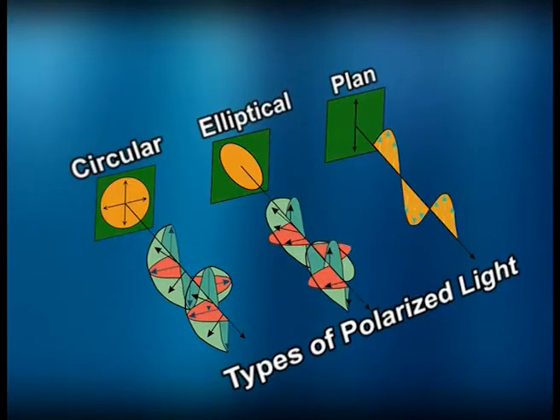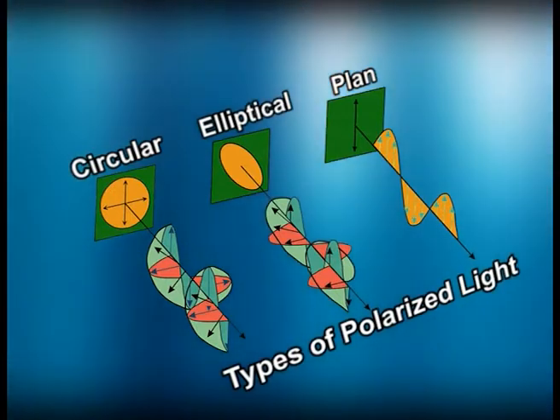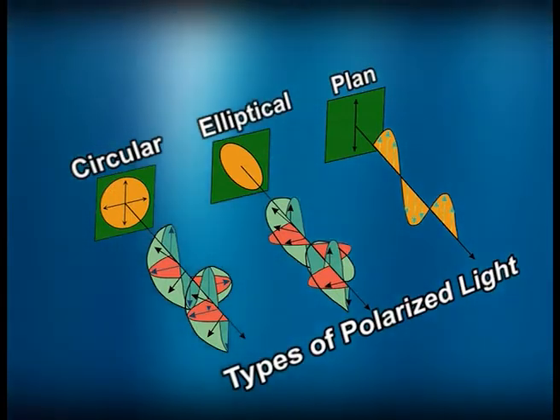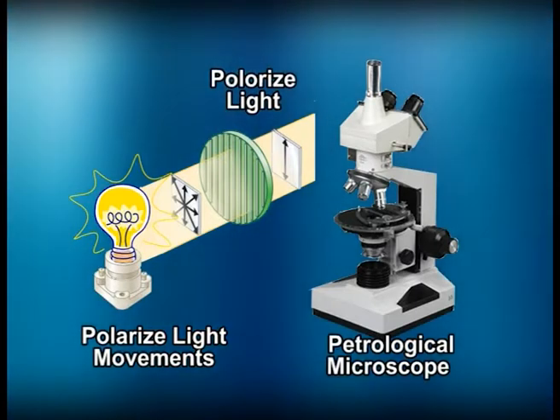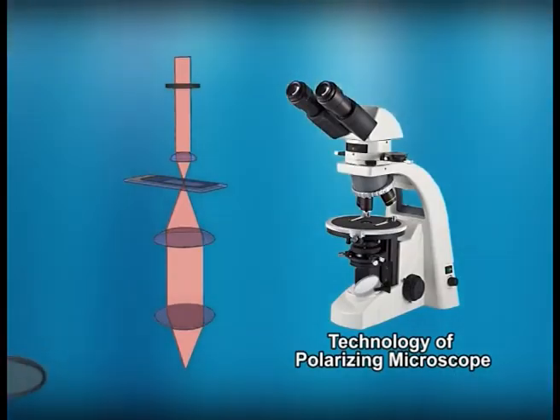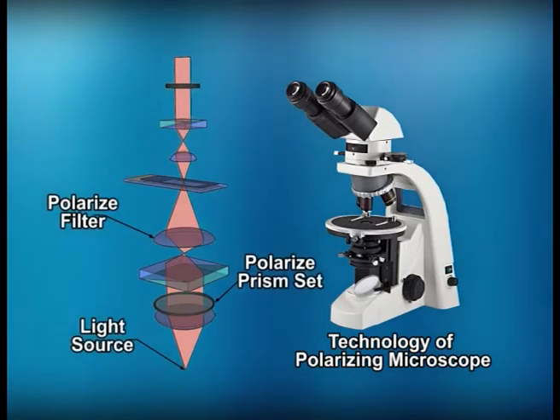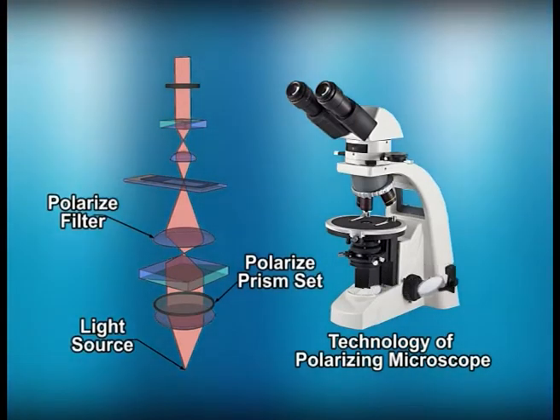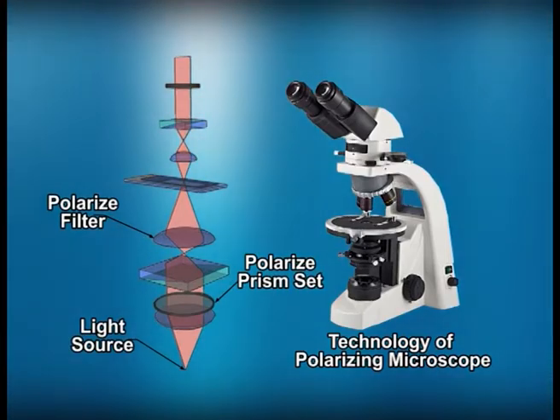Ordinary light that is reflected by the mirror, on entering the polarizer, is converted into polarized light with vibrations confined to the shorter diagonal of the rhomboidal face of the polarizer, the vibration plane of the Nicol. In most microscopes, the vibration plane of the polarizer coincides with the vertical cross wire seen in the field of view when we look through the microscope tube.